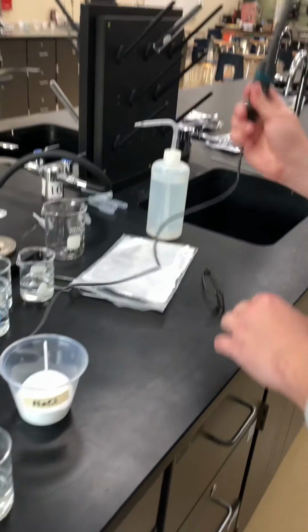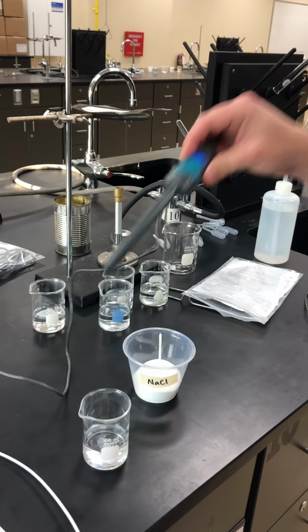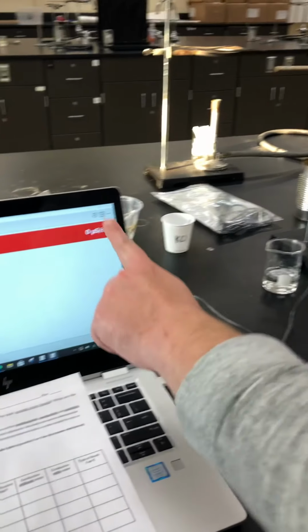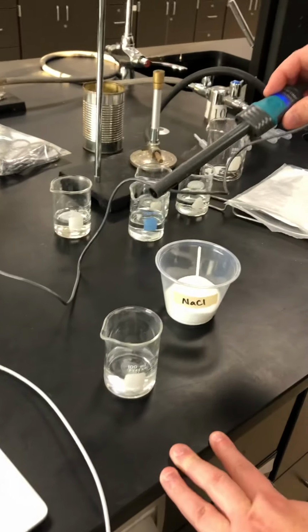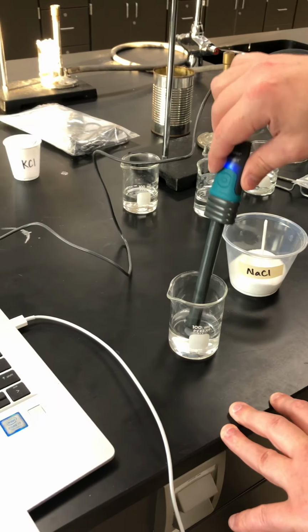Now I'm going to use a conductivity probe, and I'm going to test to see if it will conduct electricity. When I stick this in the solution, the number should go into the thousands here if it conducts electricity. If it doesn't go past 1,000, then it's more or less non-conductive. So let's test for sodium chloride.